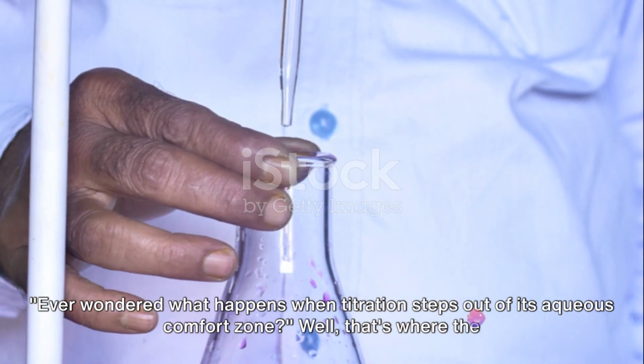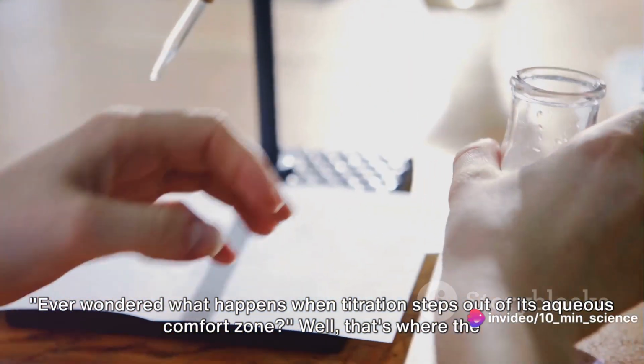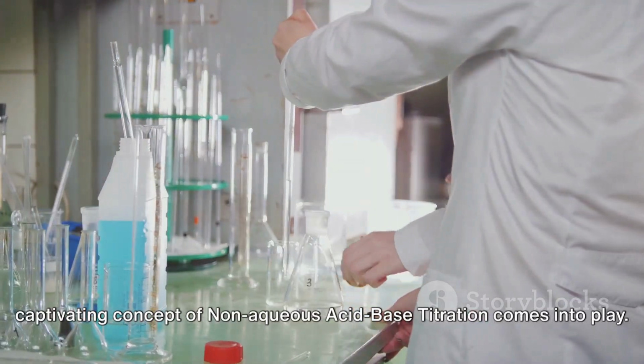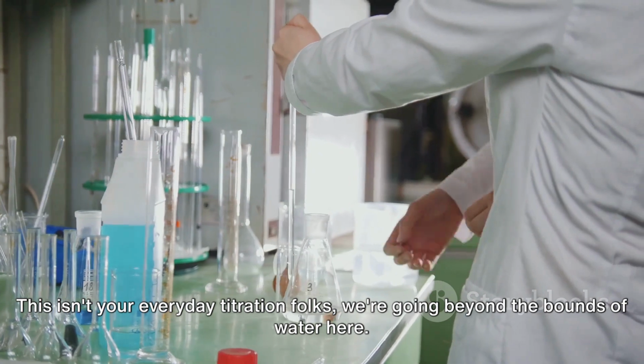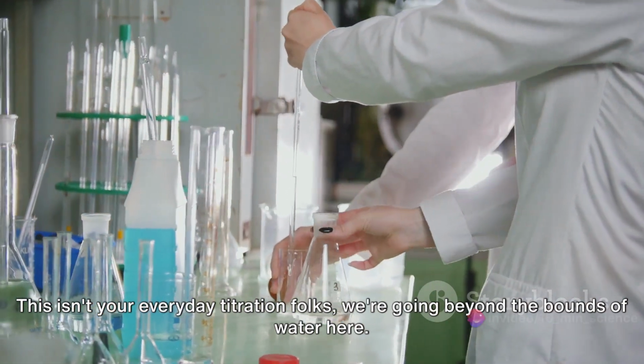Ever wondered what happens when titration steps out of its aqueous comfort zone? Well, that's where the captivating concept of non-aqueous acid-base titration comes into play. This isn't your everyday titration, folks. We're going beyond the bounds of water here.